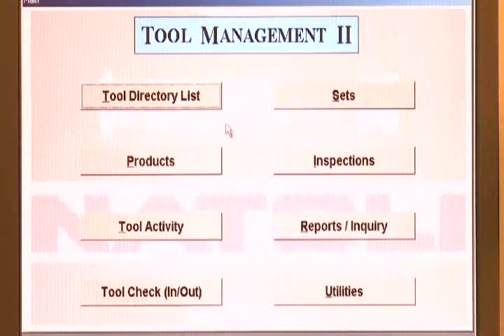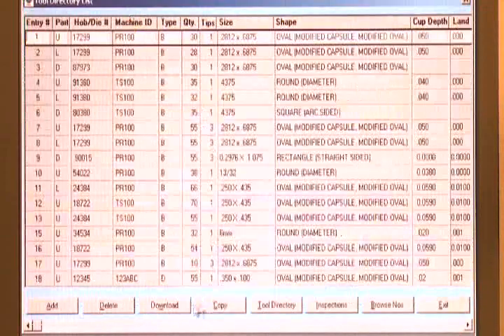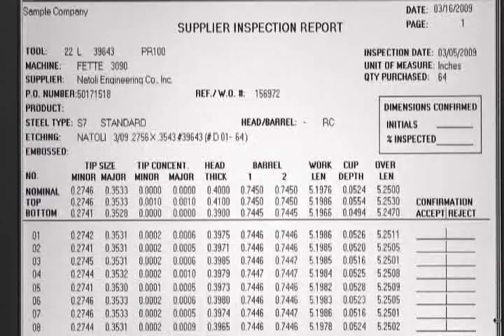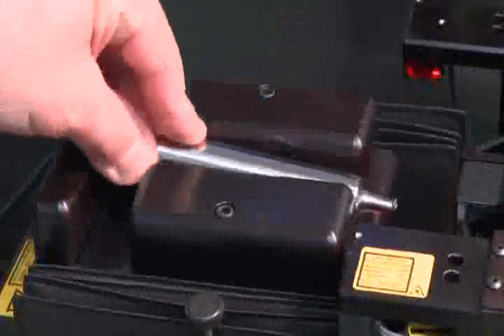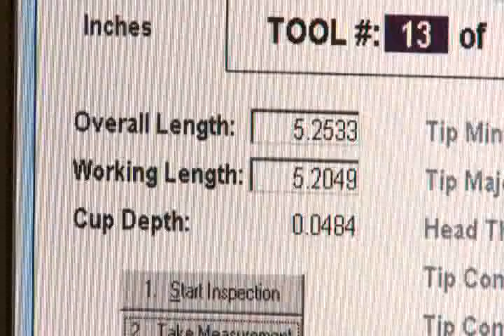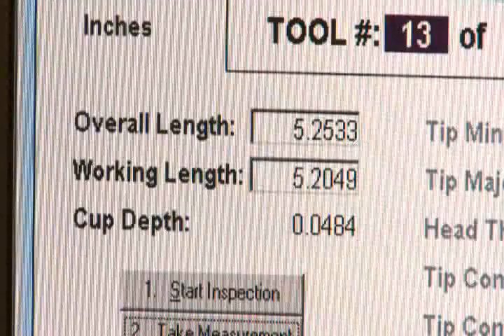Use the TM2 and with just the click of a mouse your new tool data and drawings are at your fingertips. The advantage is that it provides the customer with the entire database of information without having to do any data entry at all. It includes the supplier inspection report. Our streamlined system means better, faster inspections without data entry errors. What once took hours will now take seconds.